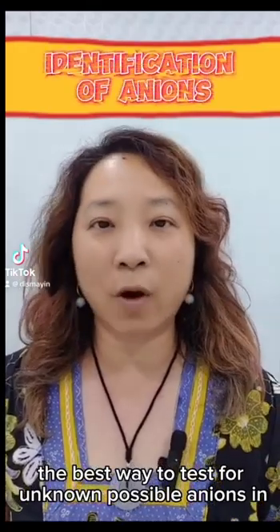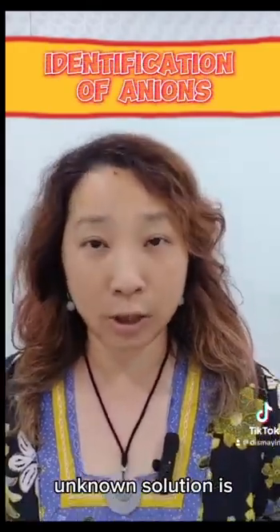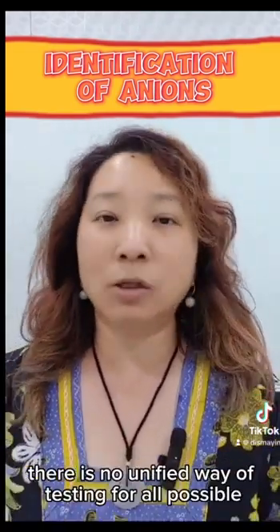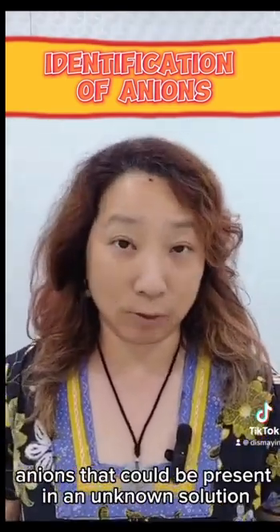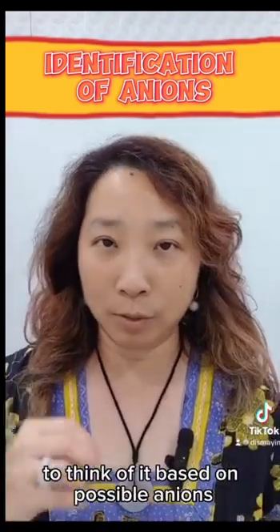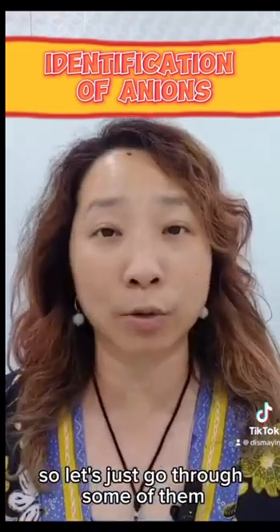The best way to test for unknown possible anions in an unknown solution is unfortunately not such an easy task. There is no unified way of testing for all possible anions that could be present in an unknown solution. The only thing I can do is to advise you to think of it based on possible anions. So let's just go through some of them.